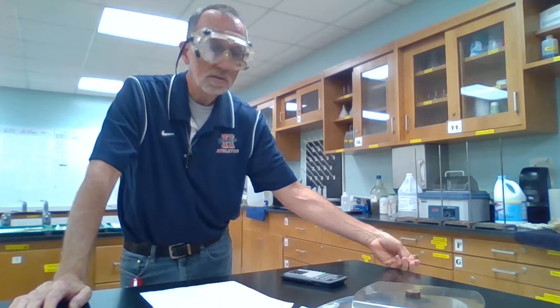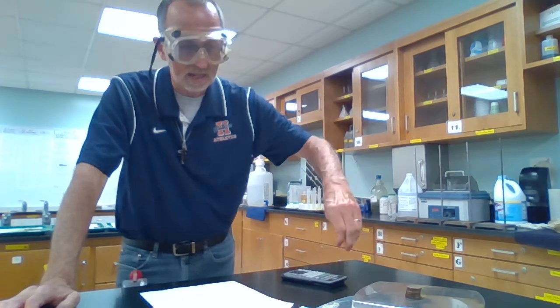Add 2 more to get us to 5. 5 pennies, 12.56 grams, 12.56. 7 pennies, 17.56 grams for 7, 17.56. 9 pennies, 22.56 grams, 22.56, and finally the last 4 gets us to 13.